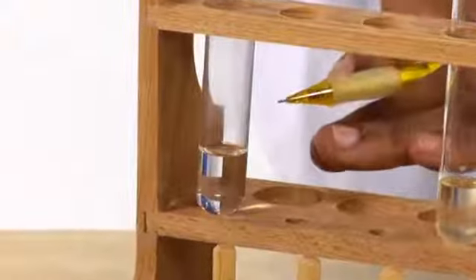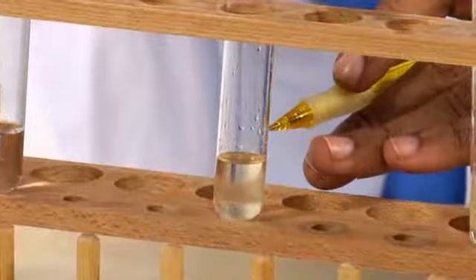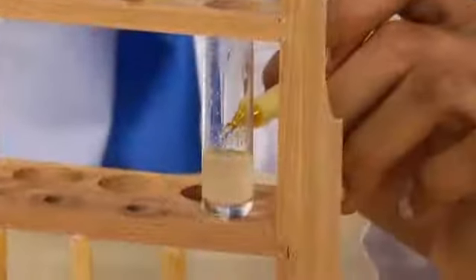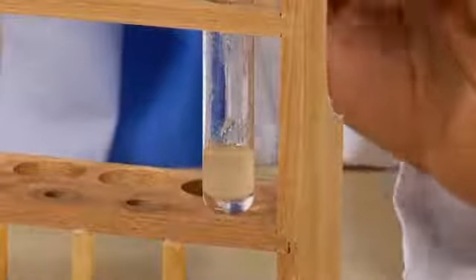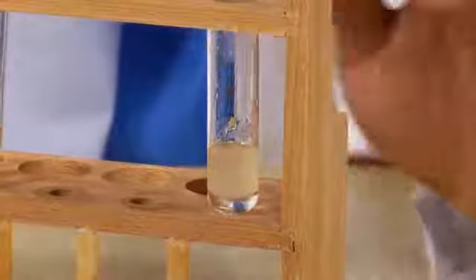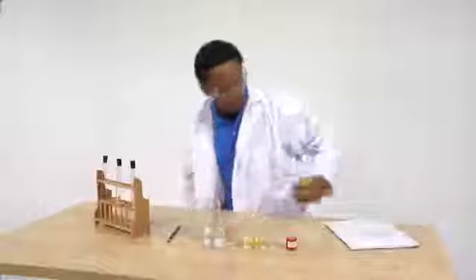The Sudan 3 sat on top of the water in test tube 1. It didn't mix with it. The Sudan 3 mixed with the vegetable oil in test tube 2, so we know that's a lipid. In test tube 3, the Sudan 3 dye mixed just with the vegetable oil that separated from the water as the liquid settled. I'll record the findings in my data table.